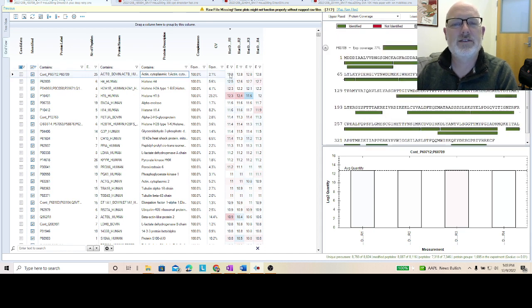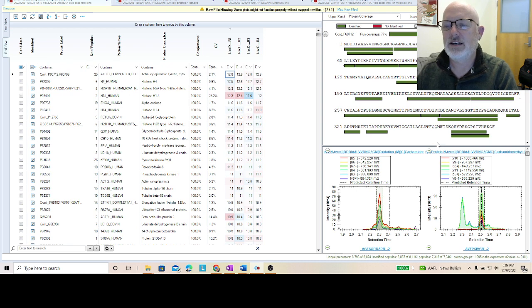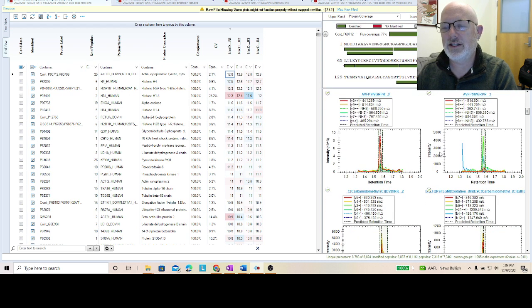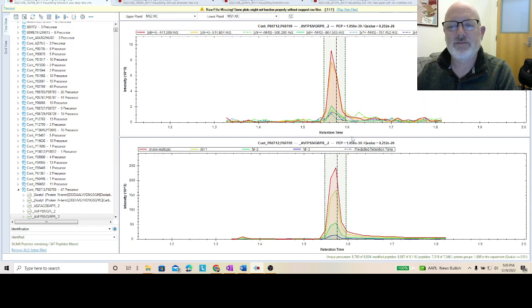We can look at some of this data to look at the peaks. These look pretty good. These are pretty abundant though, huh? So we can look at some pretty nice looking peaks here. And you could see this is the peptide monoisotopic mass as it comes off. This would be the monoisotopic plus the isotopes. And here are the fragments, fragmentation ions.